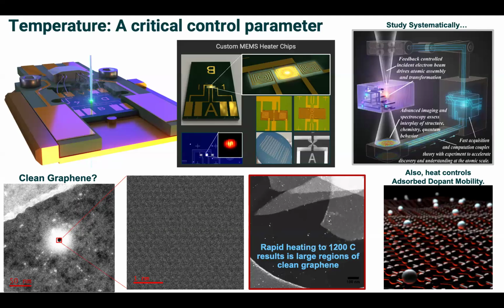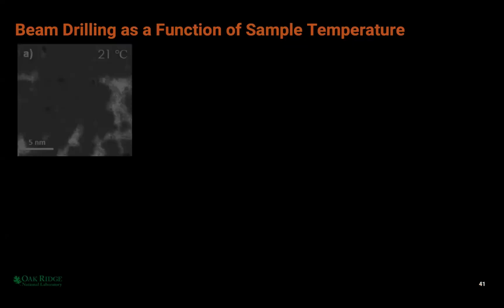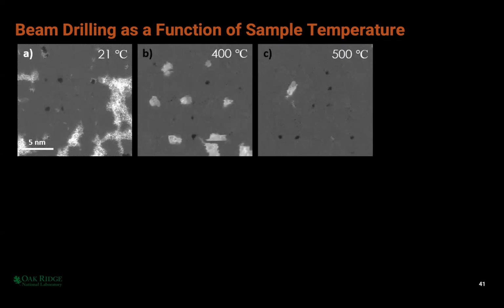And so we thought, okay, we've got our system. Let's do a systematic study. This will be easy and wonderful. We'll just figure out what the relationship is between temperature and what it takes to drill. It ends up that we ran into these really unexpected results that made us scratch our heads for a little bit, which is kind of why we get up in the morning, to get surprised like this. So if we're at room temperature, this is an example of some of the junk that forms. We drilled holes. You see it's okay. Increase the temperature, it gets cleaner. But even if we drilled a hole, it sometimes grows back a little bit. And that's possibly because there's carbon on the surface that fills in the holes that we drilled.